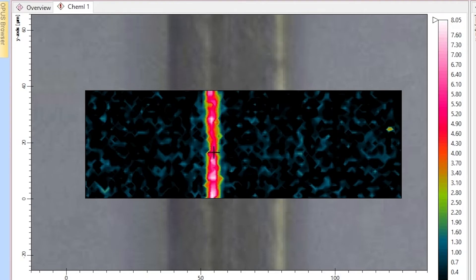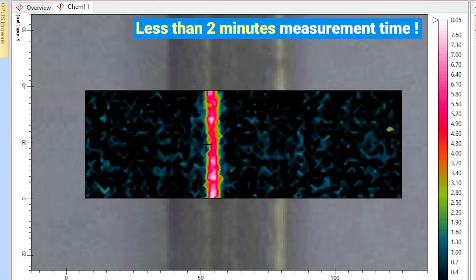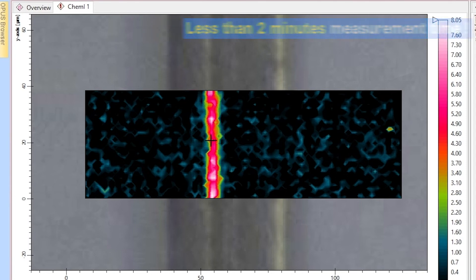The resulting IR image contains a complete FTIR spectrum in each pixel. With this massive dataset we can easily locate, verify and evaluate the oxygen barrier layer.